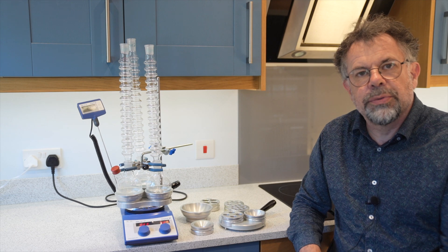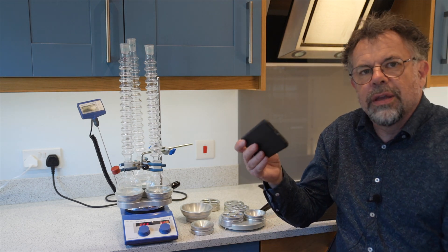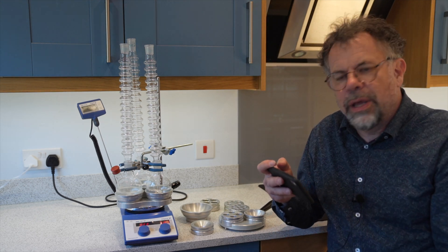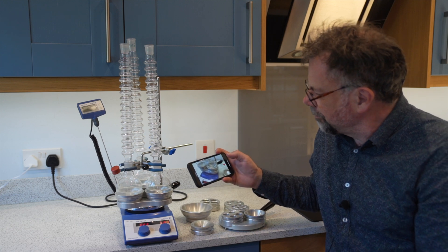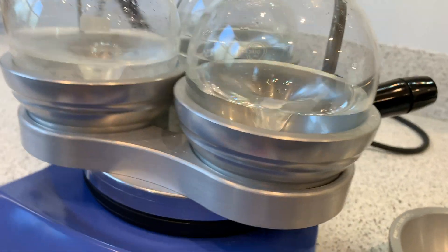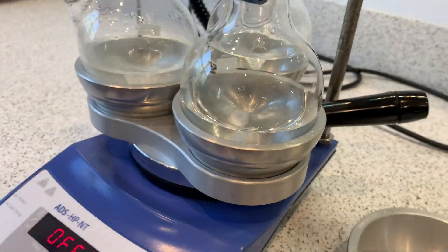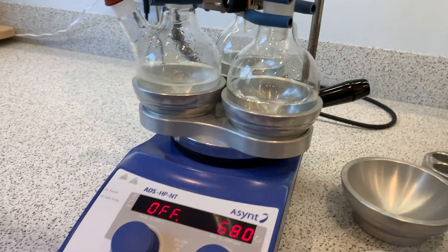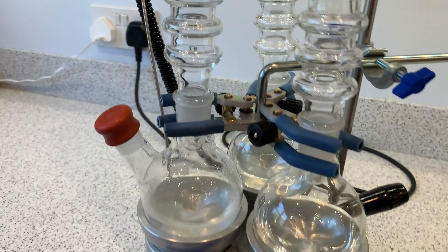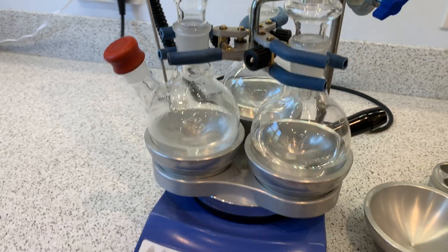I'm going to show you some close-ups now using my phone camera. I've just turned on the stirring on the hot plate — let's see how good the performance is. Here you can see very good mixing in each of the three round bottom flasks from just the one magnetic drive — very efficient indeed. And you can see the clamp mechanism: very simple design, very easy to use.